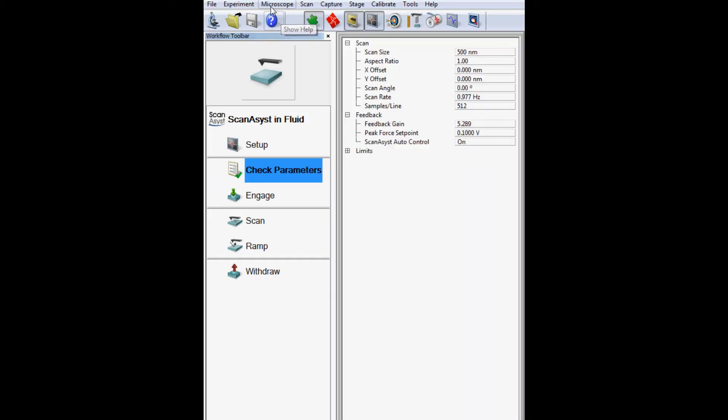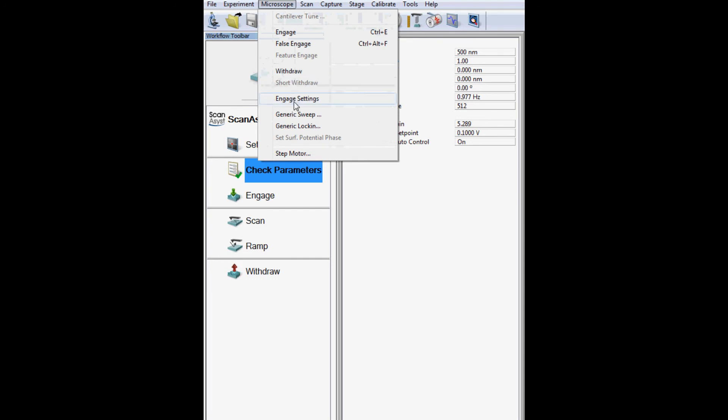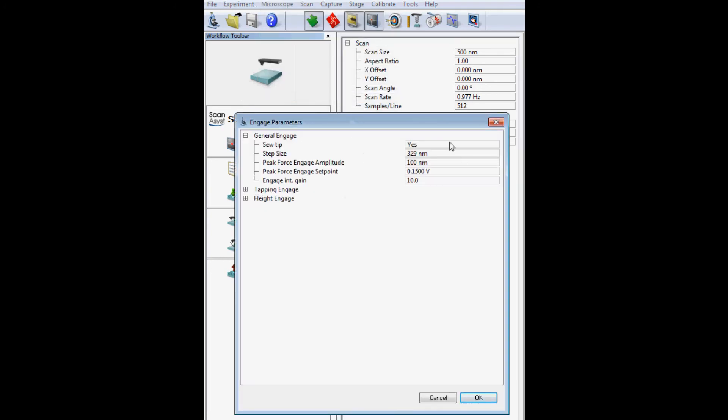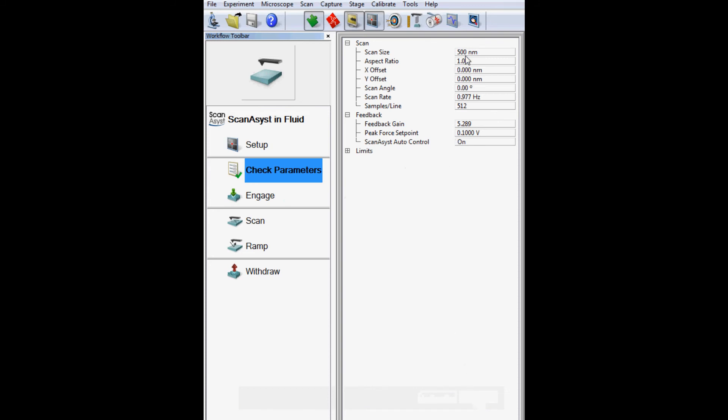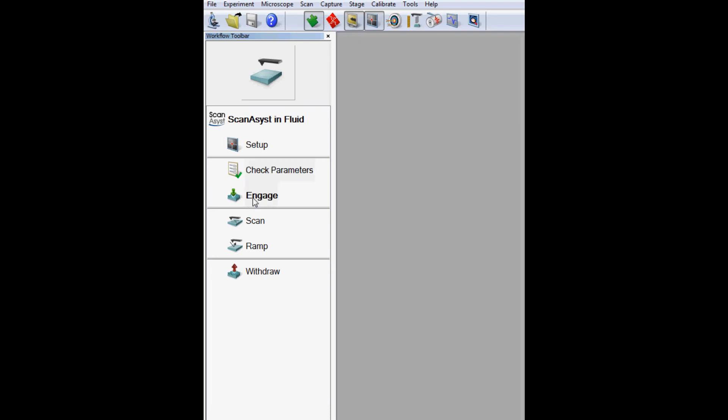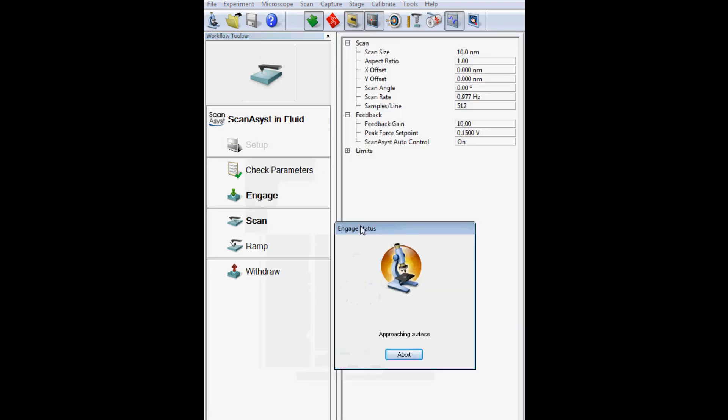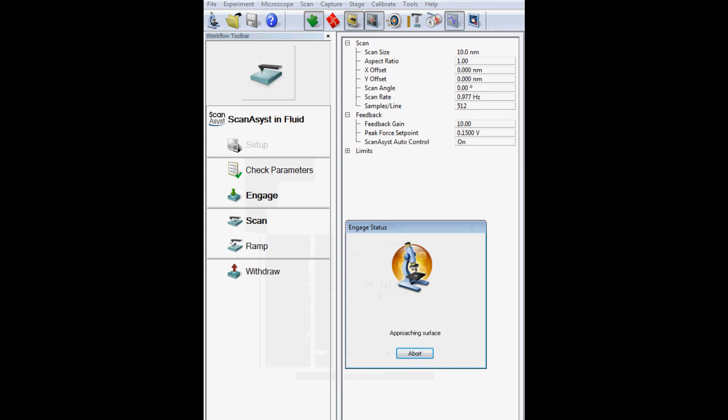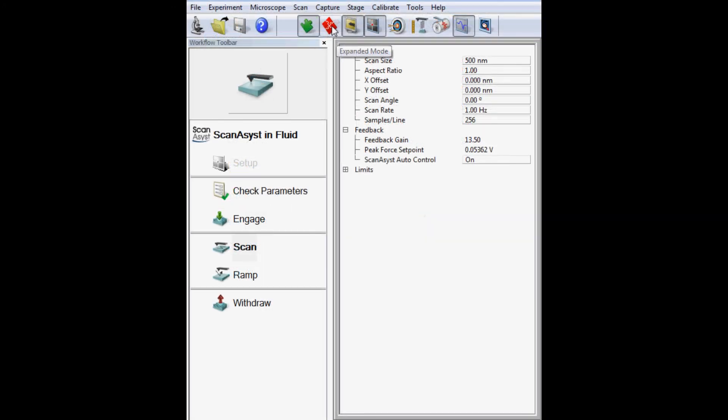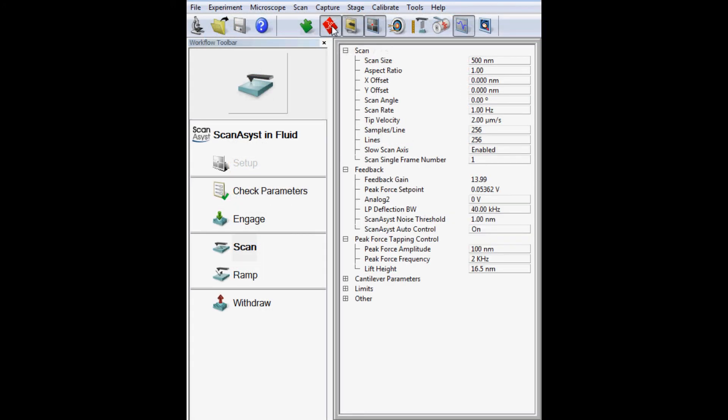Check the engage settings from the microscope pull-down menu to make sure they are normal. Verify that the scan parameters are normal and initiate the engage sequence. After the tip engages the sample, optimize the scan parameters as needed and begin the image acquisition.